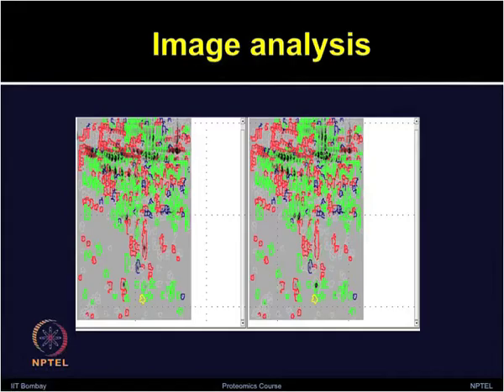But analysis in the DIGE gel is more automated. If you remember our previous discussion in the DIGE gel analysis, this analysis is more automated and more straightforward, but still you have to go through individual spots and look at how real, how significant those changes are, and you have to look at the 3D views of those spots to ensure that it is reproducible among various control and treatment groups.